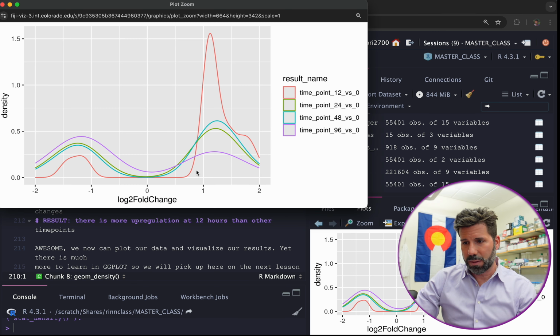So now we can see the 96 time points are changing quite largely. They have big changes. And again, most of the data is early time points are going up, so that's interesting. This is asymmetric, that the earliest time points, the genes that are changing are going up, and then only at later time points are they going down.